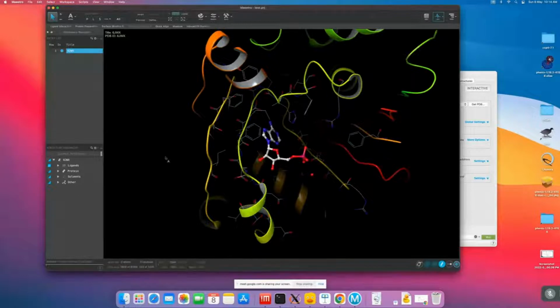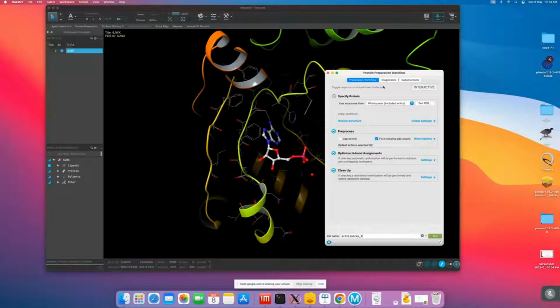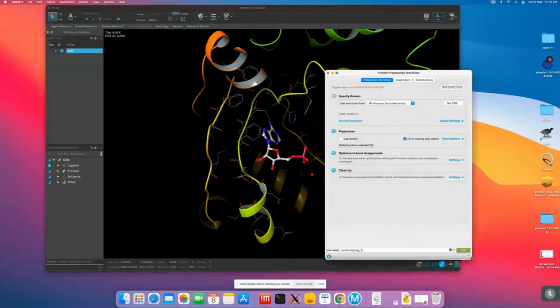Okay. So moving on to protein preparation. Whenever you are doing any kind of protein study, it's really important to understand that the protein should be in its minimized structure. The protein preparation wizard or workflow of Schrodinger is made in such a manner that it will utilize the OPLS force field. This OPLS force field has all the parameters required for minimizing the protein structure so that it is in the minimized state. Whenever a drug wants to bind to it, the protein should not be in high movement, so that the drug couldn't bind it. So it's really important that the protein should be in minimized manner, and the drug should also be in minimized structure when you are doing any kind of docking studies.